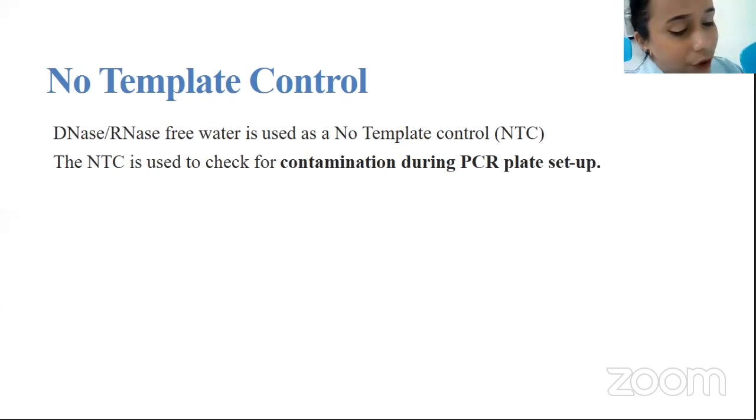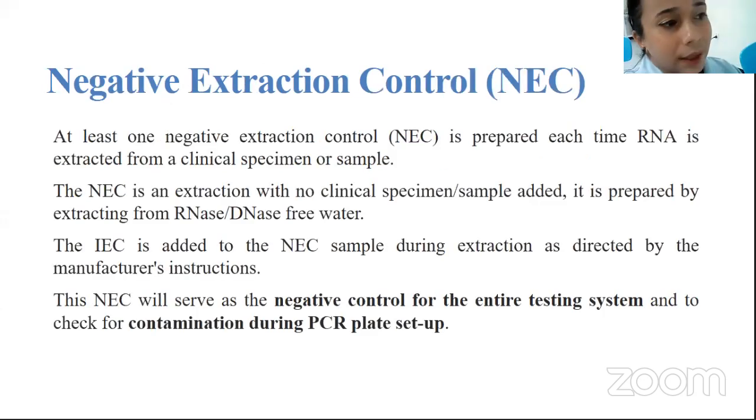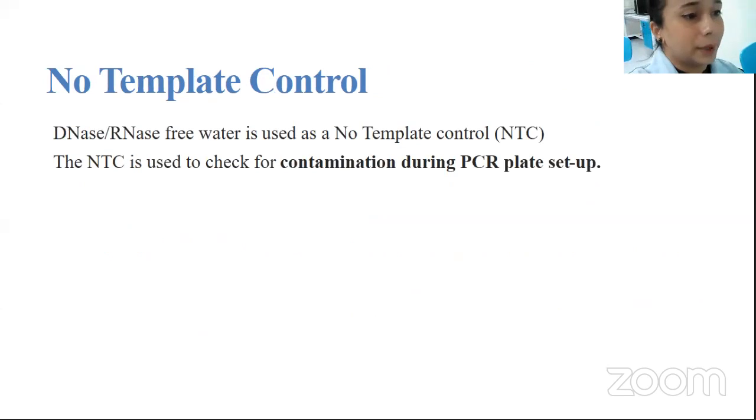Apart from the positive control and the NEC, that is the negative extraction control, we have the no template control, known as NTC, for which we use DNase, RNase free water during PCR. The NTC is used to check for any possible contamination during PCR plate setup.